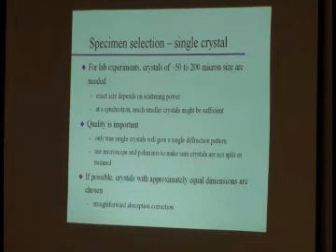How do you figure it out? It's tough, right? Well, first of all, you use a good microscope. You look at it closely. You inspect it. You make sure it looks pretty. We looked at those early pictures of crystals, right? Those were huge things, I agree. But on a small scale, that should hold true. A crystal should have faces. A crystal shouldn't look like there are two pieces grown together at odd angles. That's probably a twin, okay?